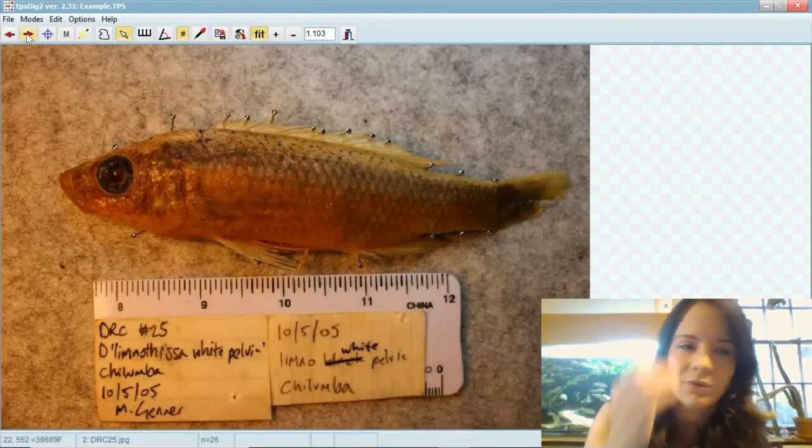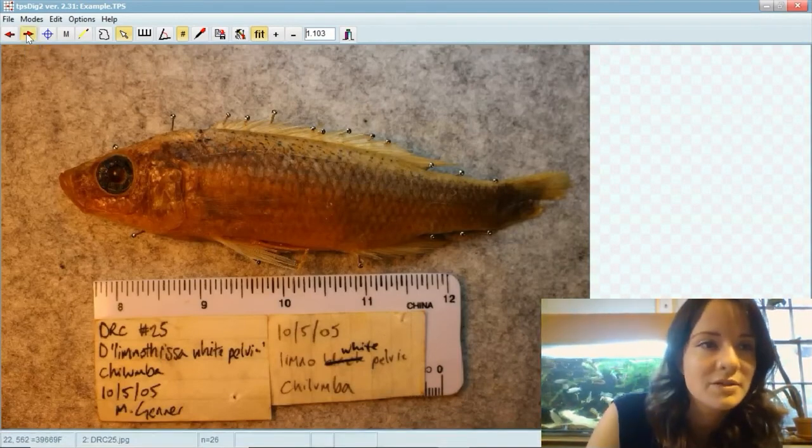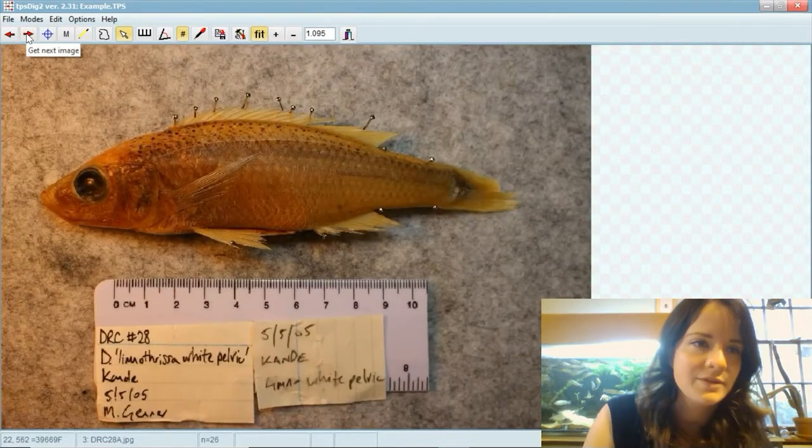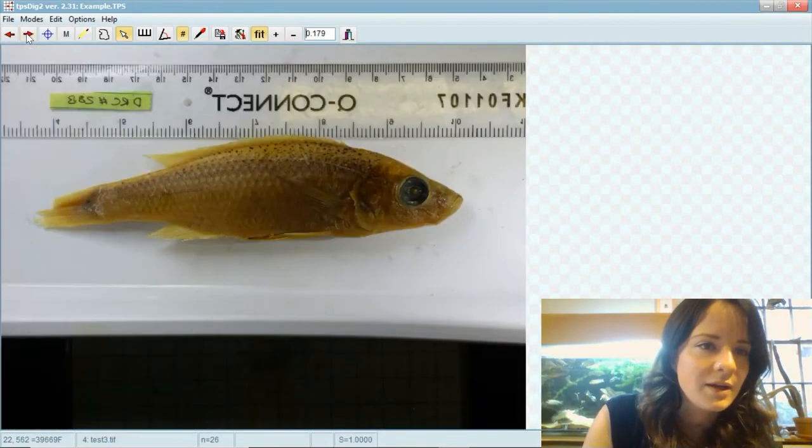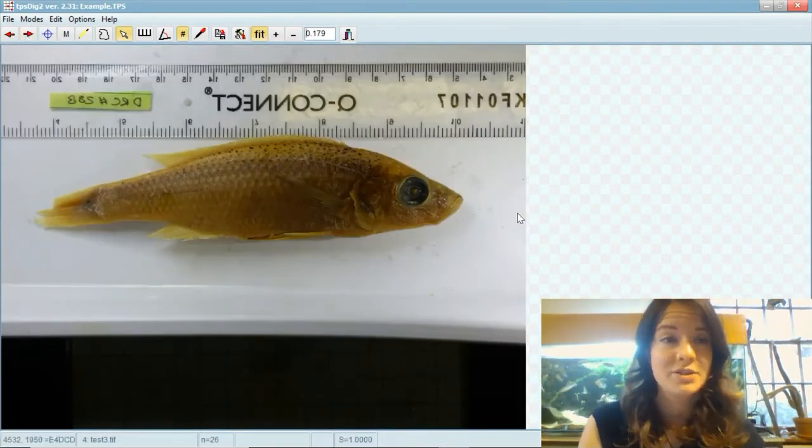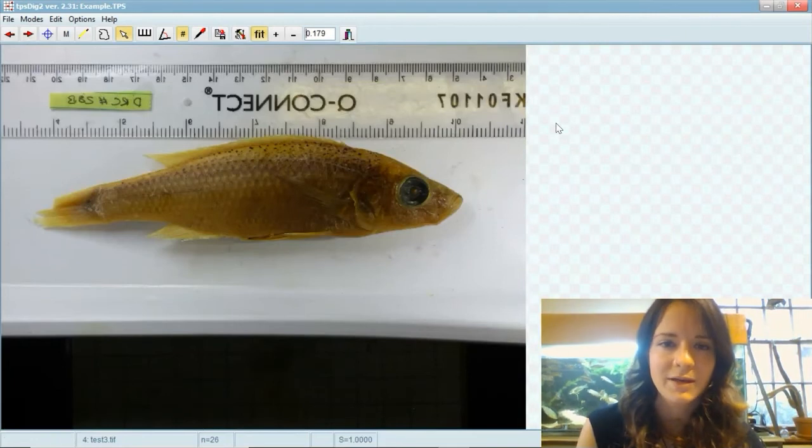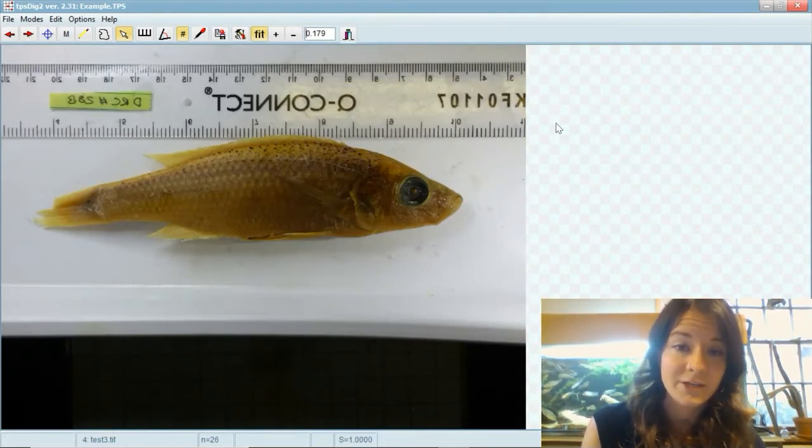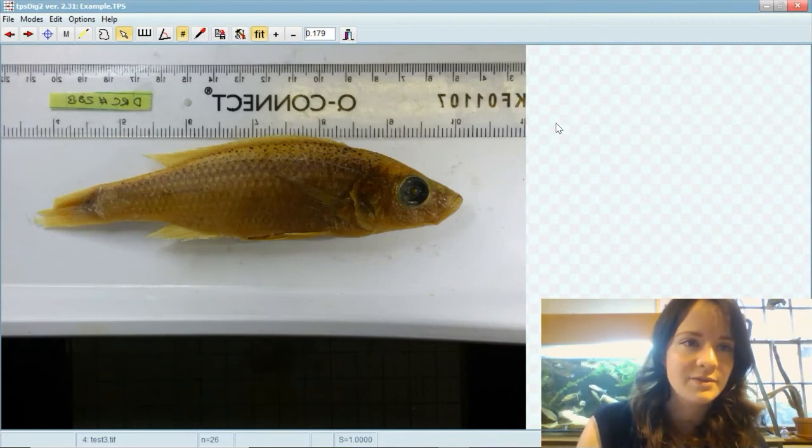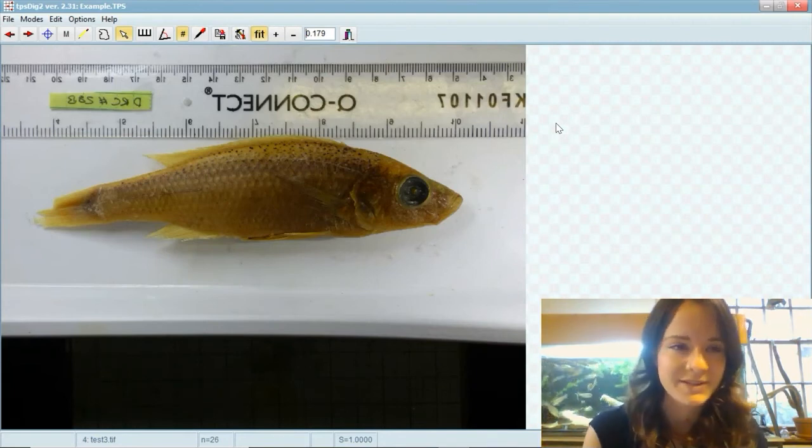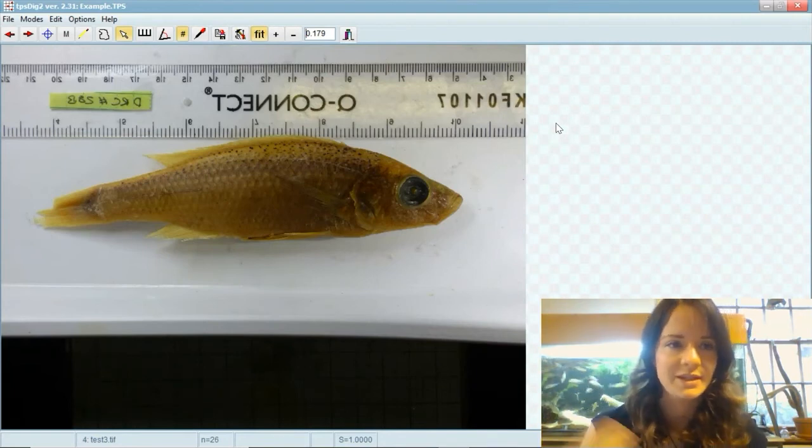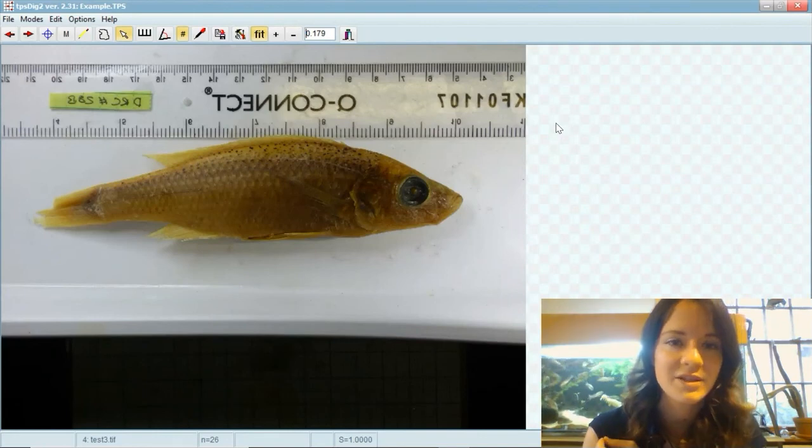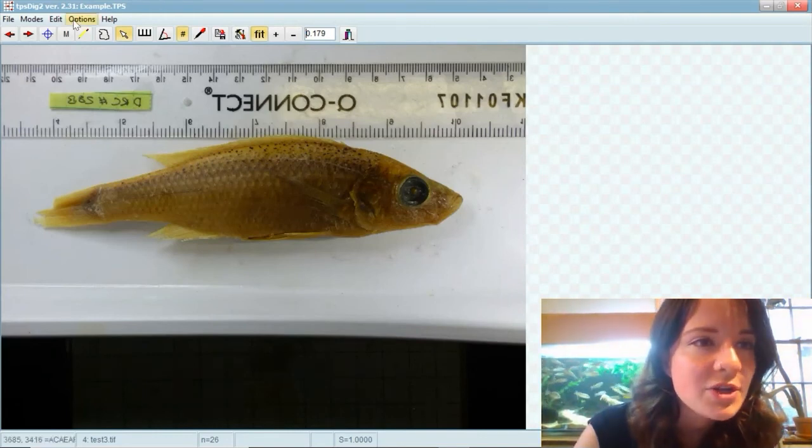So you've got all your fish and all the pictures, here we've got them all facing left, and then you've got one photograph which is the wrong orientation. Normally you'd have to flip the actual photograph and then rebuild the landmark file using TPS util and then open it again in TPS dig. But instead you can just go to options.